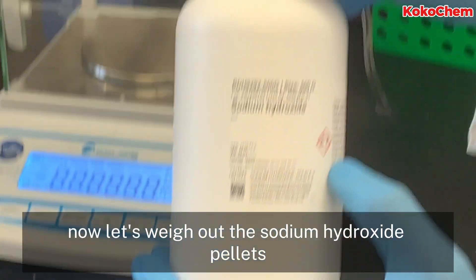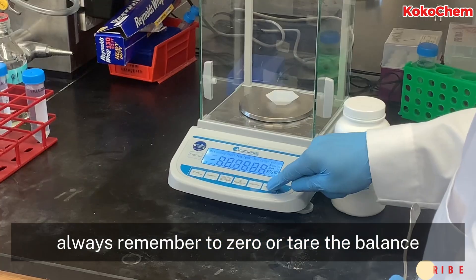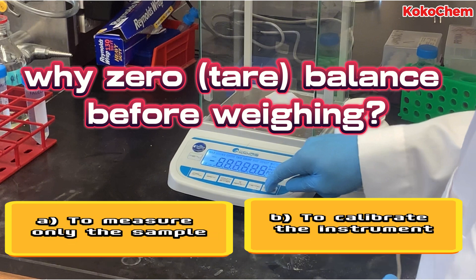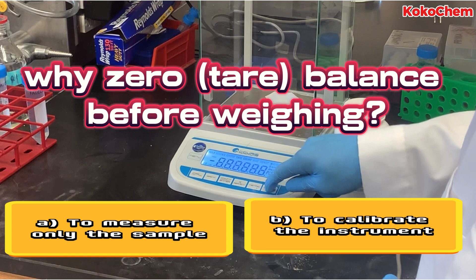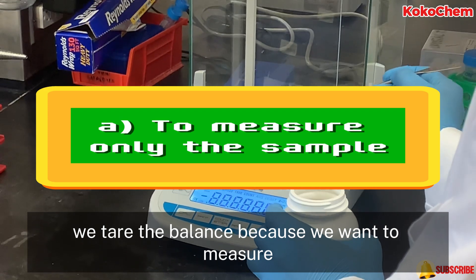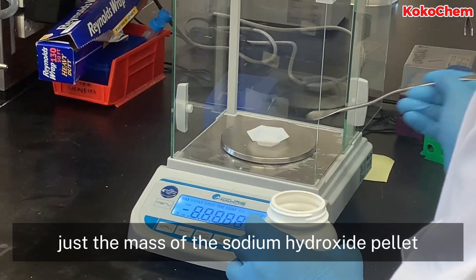Now let's weigh out the sodium hydroxide pellets. But before we do that, always remember to zero or tare the balance. Quiz: why zero or tare the balance before weighing? If you selected option A, that's right — we tare the balance because we want to measure just the mass of the sodium hydroxide pellets.